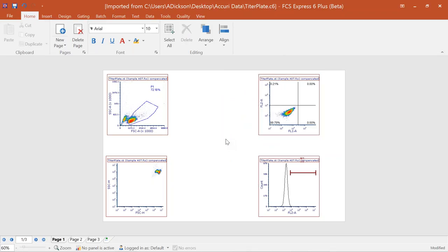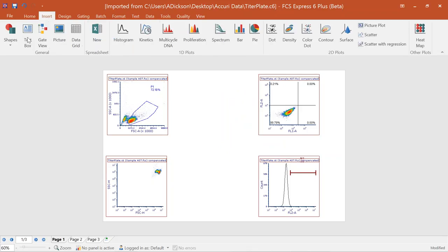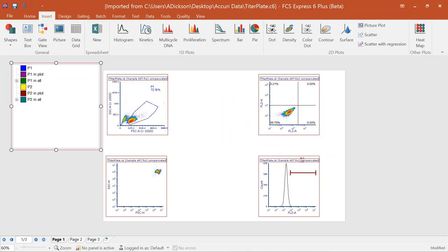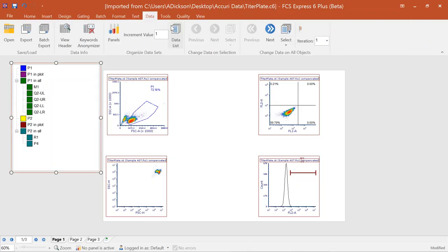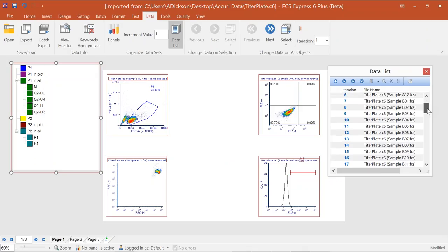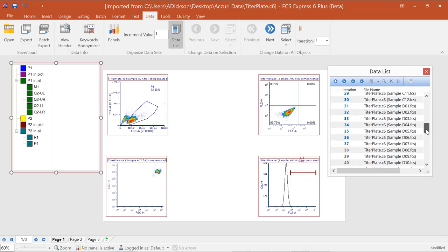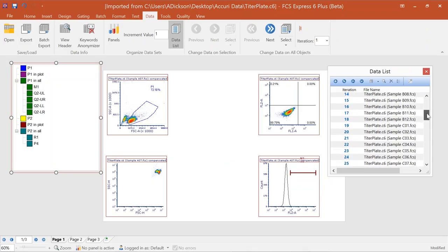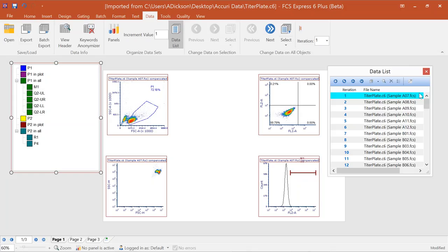From the Accurie data import, just like the DIVA import, this is just a starting point — all the plots and gates are there. Go to the Gate View to see all available plots. Open the data list and you'll see dozens of data files associated with all the individual wells from the multi-well plate. You can change the active data file just as you did in DIVA.